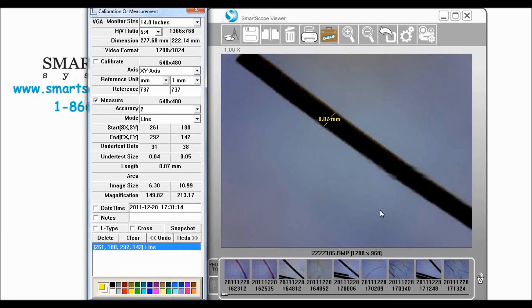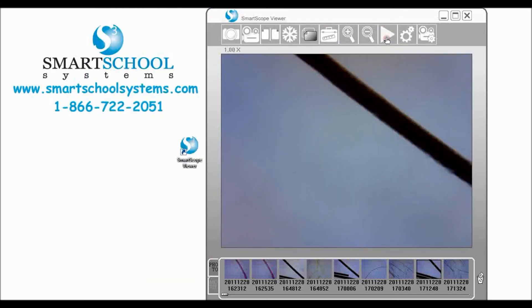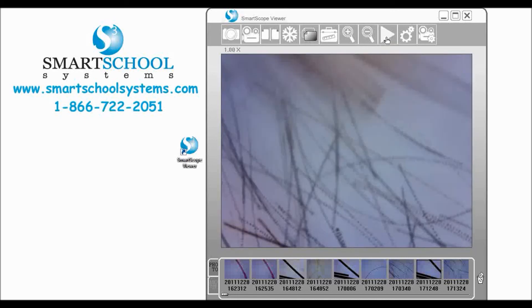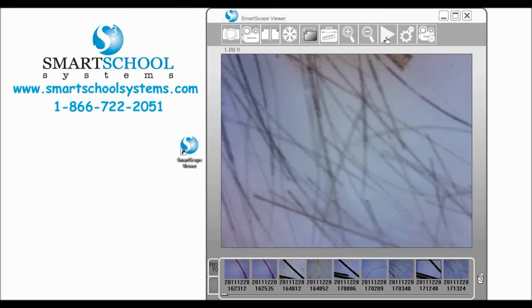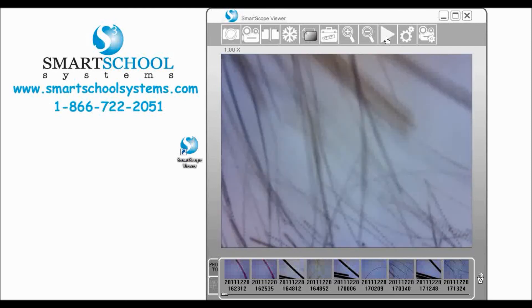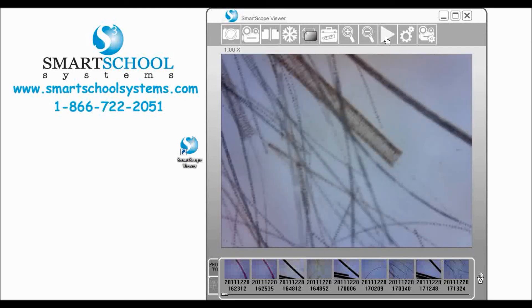So we're going to come out again. We're going to come in here. We're going to get our slide of our rabbit hair. We're going to put our rabbit hair underneath the scope here.